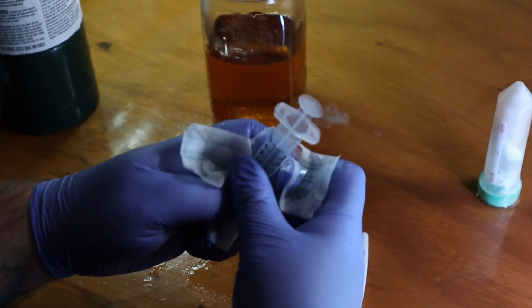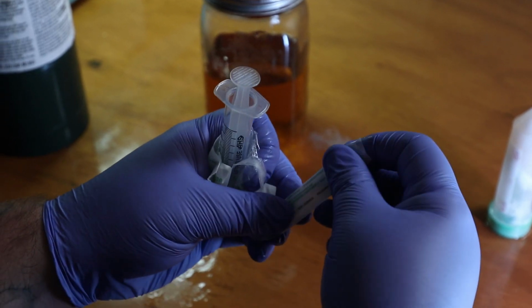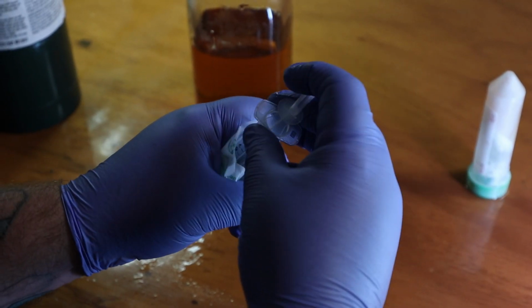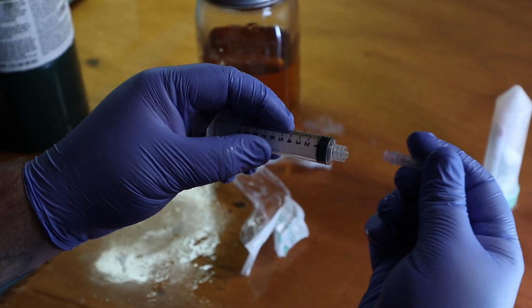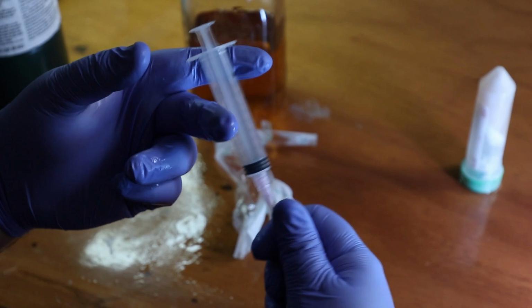I then open the packaging. Notice how I opened the closed end, the plunger end, and then I'll open the cap end of the needle. This way I'm not getting any dust or anything that might be on the packaging inside the syringe or needle. And then I open it.